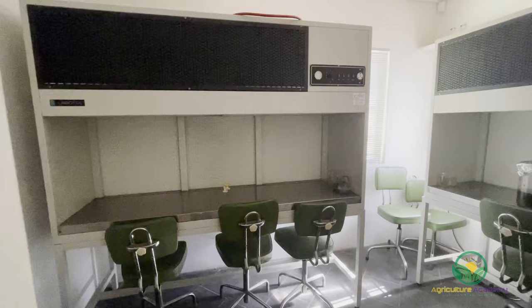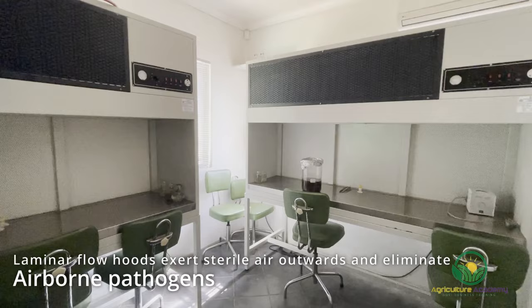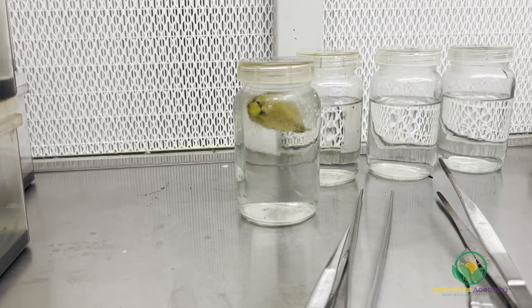The rest of this process took place in a laminar flow room. A laminar flow hood exerts sterile air outwards, making sure no airborne pathogens find their way into your flasks. At home, make sure you are in a clean, dust-free room and try to protect your work with coverings like plastic boxes for you to work under.